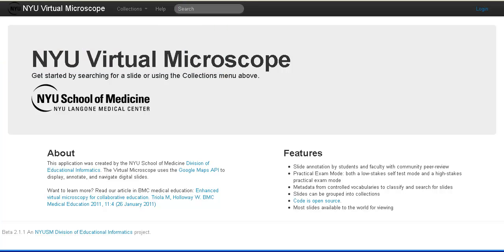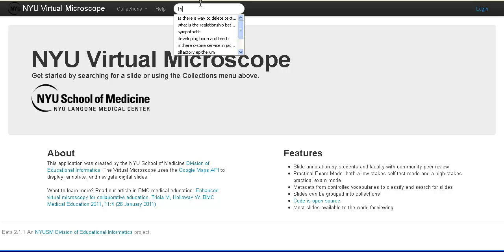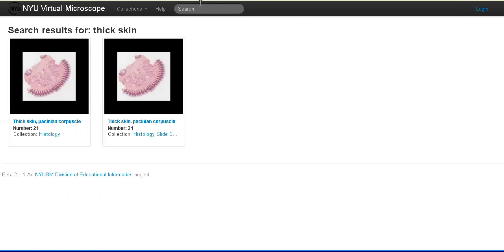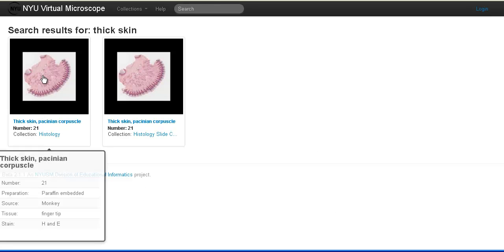Vertebrate Histology Lab, Integumentary System Part 1. We're going to be taking a look at two slides: Thick Skin and Pacinian Corpuscle. I'm going to click on Thick Skin and we're going to click on slide 21 from the histology collection.